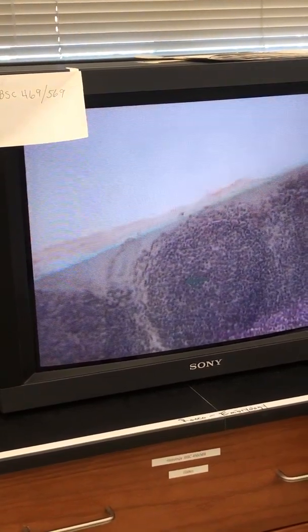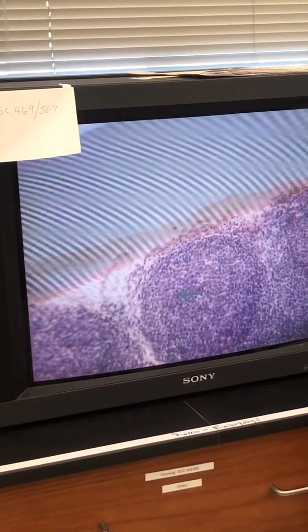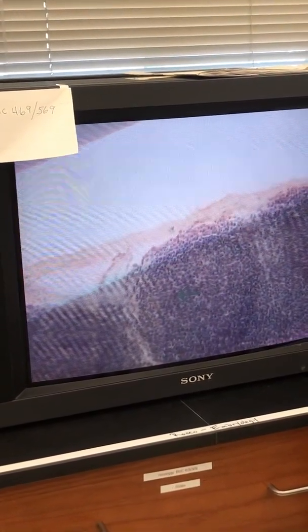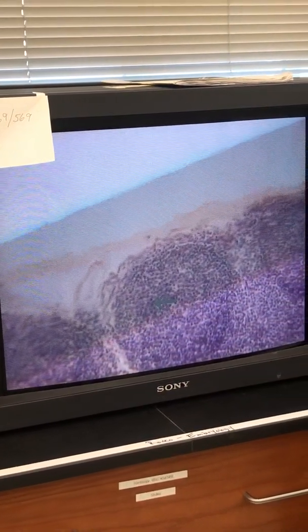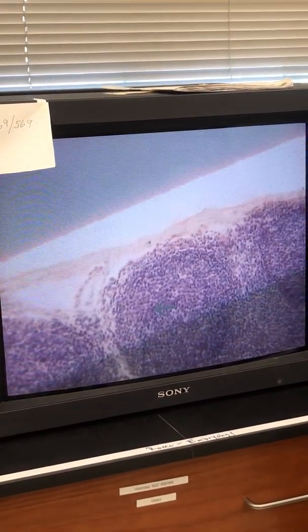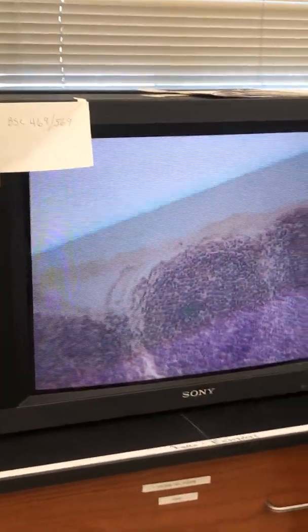It has both in parentheses. The reason being is that you'll see septa somewhere else, and essentially it is the same thing. But because you have something else labeled trabecular sinus, it would be best to call it trabecula, which is its real name. Which one is the trabecula? It's your connective tissue that divides the node into compartments.